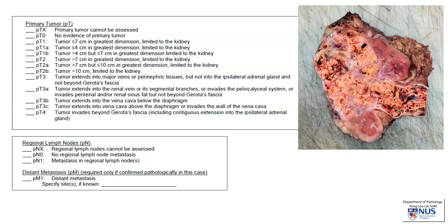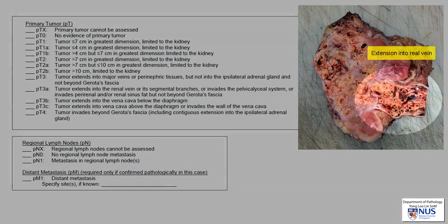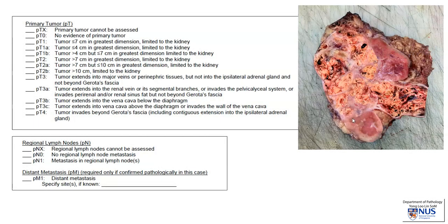We can see grossly that this is a very large tumor, and I would be concerned about this area — whether or not it is going beyond the capsule. There is very obvious gross involvement of the renal vein in this instance, and so the vascular margin would be very important, as that is also a surgical margin. Because the tumor is obviously going into the renal vein, it would already be stage 3 — at least PT3A, which extends into the renal vein. We can't really see whether it goes to the vena cava, so that sometimes relies on radiologic features or intraoperative findings. So this is at least PT3A, and we would need to examine the area of capsular invasion microscopically as well.